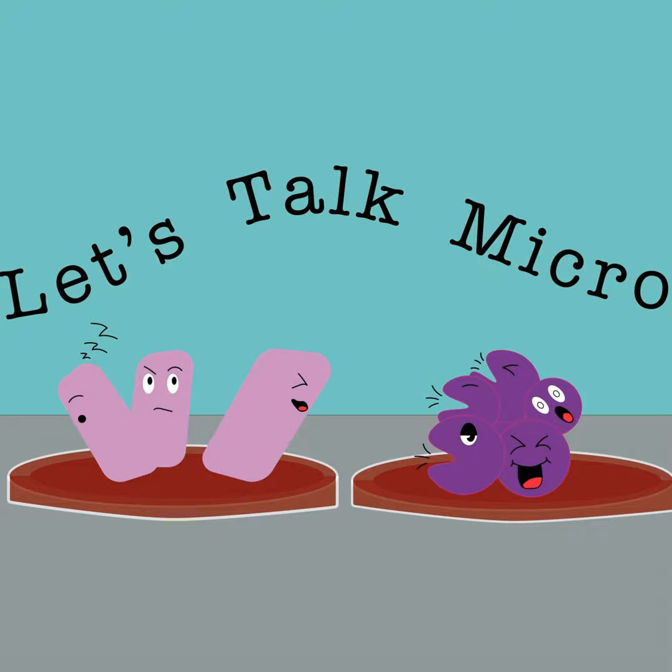So maybe if you are a medical laboratory scientist student, or you're a microbiology student, or you just work in the lab already, and you definitely hear terms like next generation sequencing, you hear terms like whole genome sequencing. Maybe you send an organism that you couldn't identify in your lab, and then when it comes back, you see, or you read it on an article that it was ultimately identified by whole genome sequencing, right? So today we're here to talk more about that.